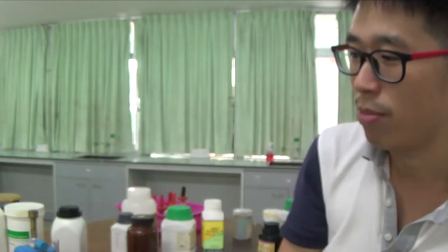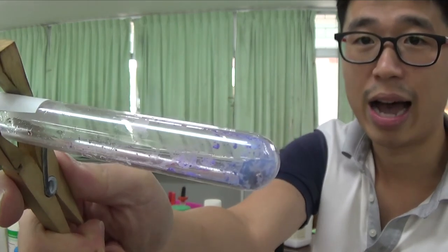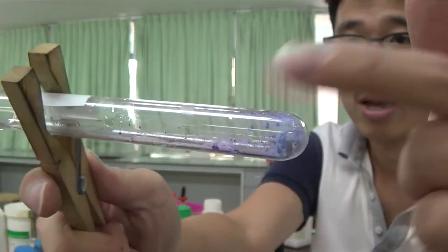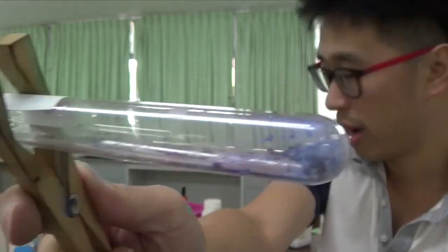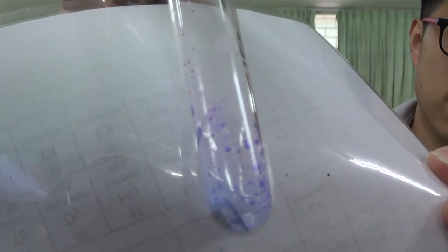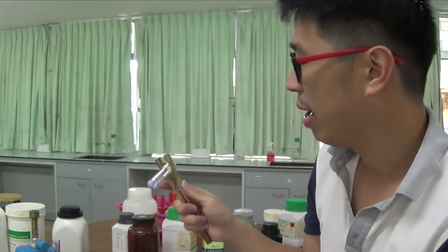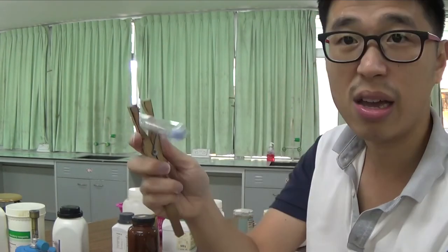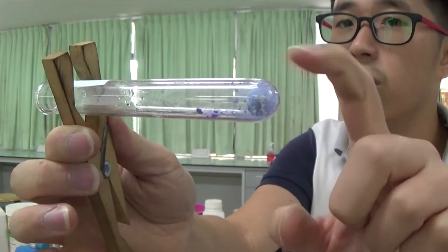The anhydrous should have been blue, just like this cobalt 2 chloride hydrated salt that we heated up until we got rid of all the water. And then this is the blue color, a very light shade of blue. That should have been the color of this paper that we are going to test for water. So we use anhydrous cobalt 2 chloride paper in order to test for water.